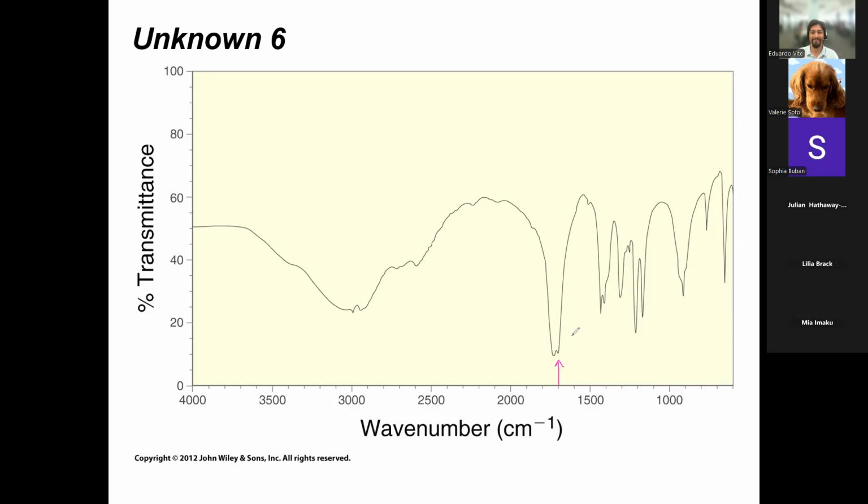You need to know it. Very iconic. First one we look for. Carbonyl. Thank you. This is a carbonyl peak for sure. Even though the resolution is not very good, the fact that it's at 1700 and it's strong, almost touching the axis, tells me this is a carbonyl.